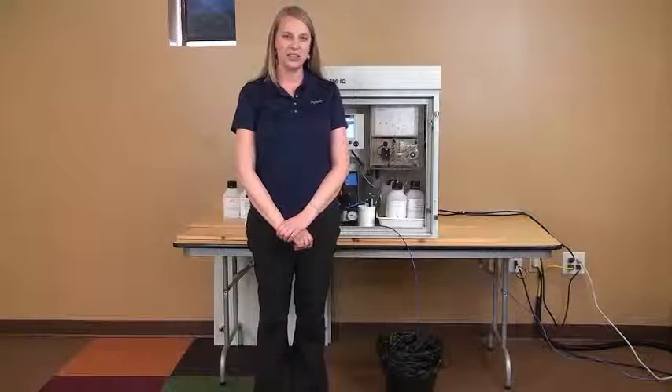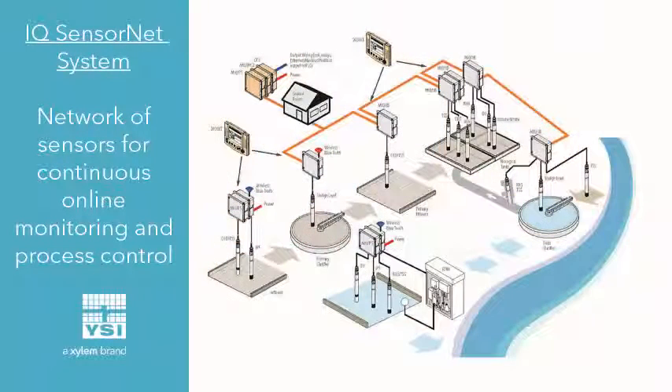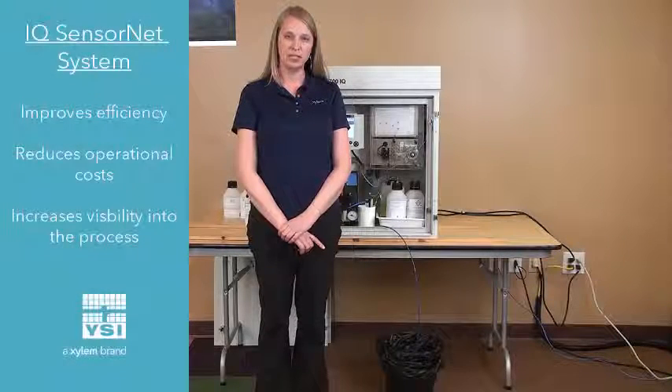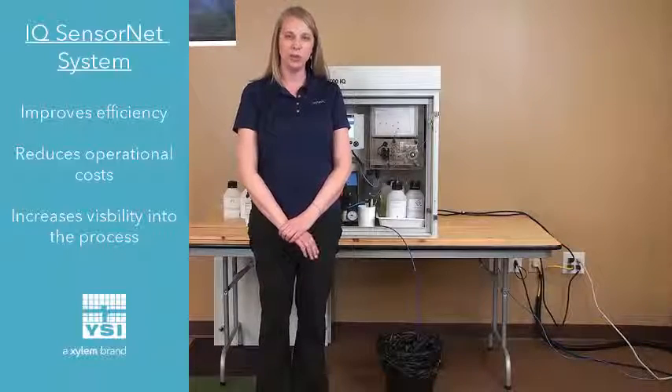Our Orthophosphate Analyzer is designed to be used with our IQ SensorNet system. The IQ SensorNet is a network of sensors that can be mounted for continuous online monitoring and process control for wastewater treatment plants. It helps improve efficiency and control and cut costs when running wastewater treatment plants.